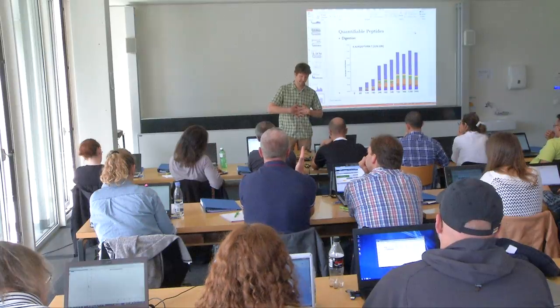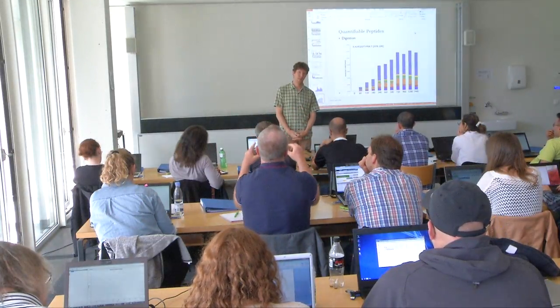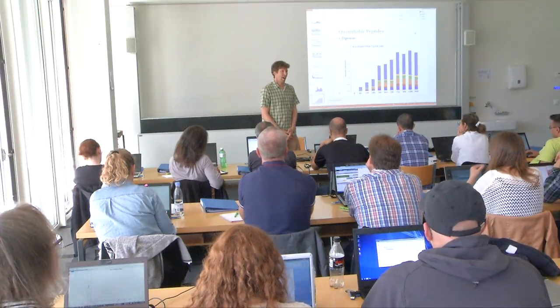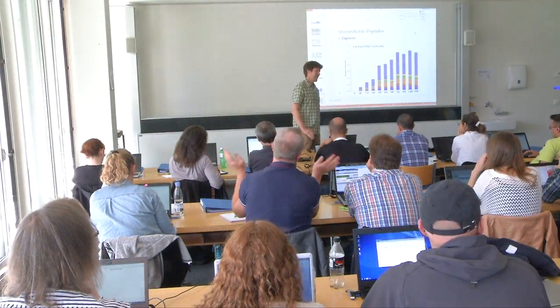Mm-hmm. There's a problem here. The file pops up. Mm-hmm. There's some kind of feature you tend to add. So to see the data when you have multiple.